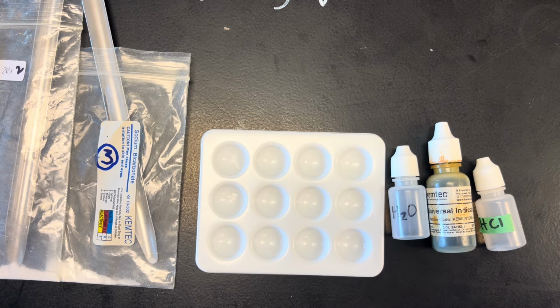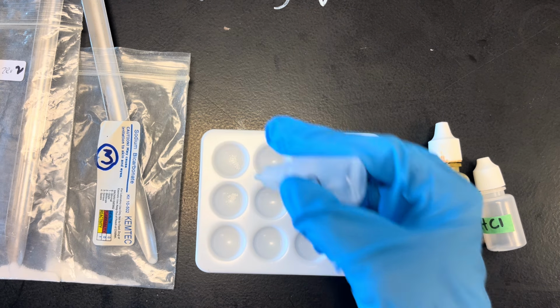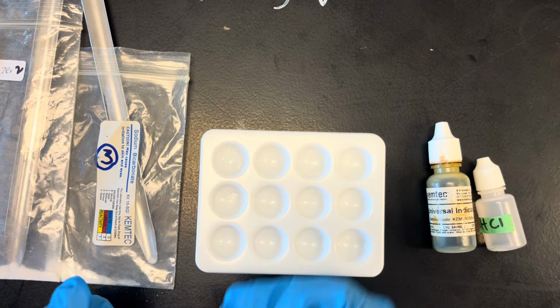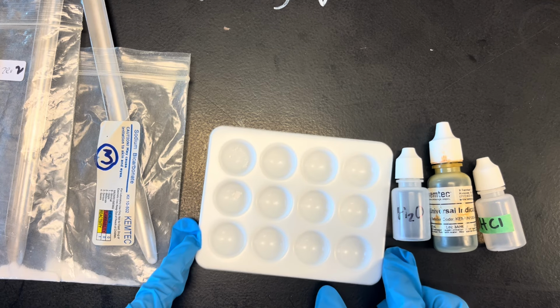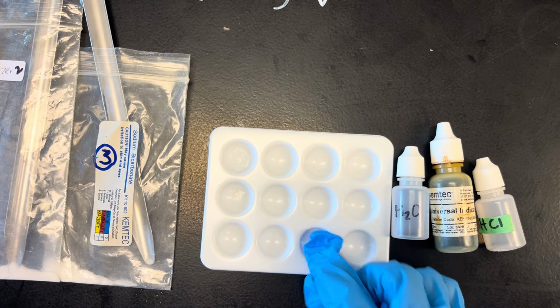Then after you record the color and texture, you're going to test them with water by adding 5 drops of water to the first well. And you're going to look for any reaction. In this case, I don't see any bubbles or color change or fizzing. But you could also look for things like, is it soluble? Does it dissolve in water? If you're not sure, a good method is just to agitate the tray like this to see if it dissolves.